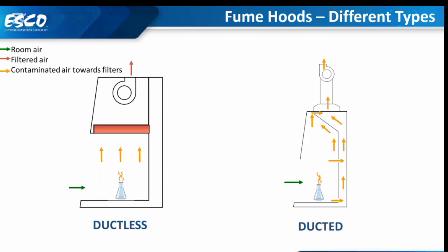Yet the ducted fume hood is capable of being used with a more extensive list of chemicals. It will have a duct leading outside of the large work area. I mean, the air is not filtered. The fumes, the contaminated air, is exhausted on the ducted fume hoods.